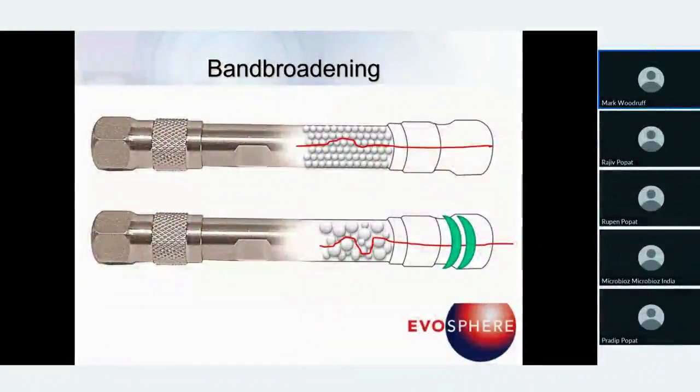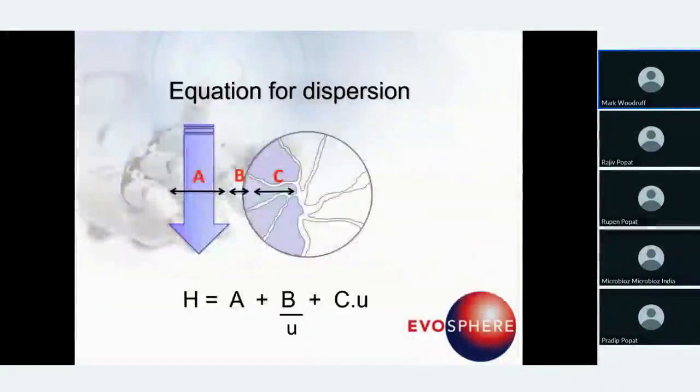If we have monodispersed particle sizes, so the column packed at the top, the eddy diffusion is lowered very significantly. And what this means is that your bands, your peaks, your analytes that are exiting the column will be not only much better resolved, but will also be much sharper. And therefore you're seeing these efficiency numbers. So you're seeing the 50-60% gain over traditional 5 or 3 micron particles. And it's due to the dispersion that's happening in the column.